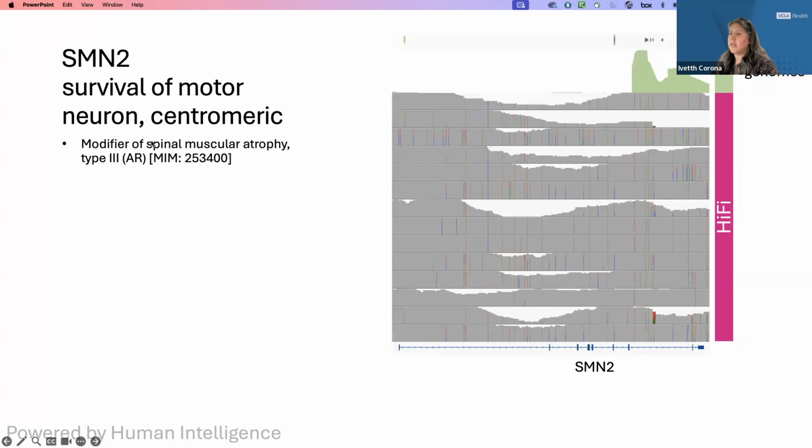So this is another problematic gene. It's from the same family, SMN2. You can see that it is also covered only on the 3' end of the gene, and it also has variants annotated in gnomAD, mostly on the 3' end. And you also have genomic variation that I suspect is going to be common throughout the gene and is not annotated in gnomAD.